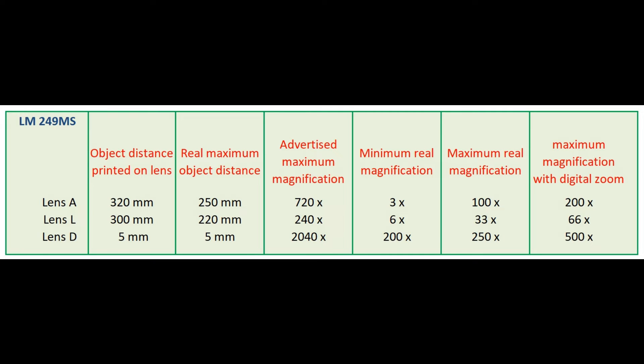Of course you can show the image from the microscope on a large screen using the supplied HDMI cable, but there is absolutely no display of more details. Here are the magnification values as I measured them from the 10-inch screen.